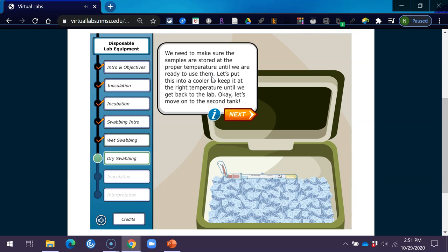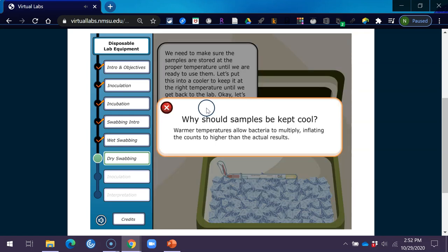We need to make sure the samples are stored at the proper temperature until we are ready to use them. Let's put this into a cooler to keep it at the right temperature until we get back to the lab. Warmer temperatures allow bacteria to multiply, inflating the counts to higher than the actual results.